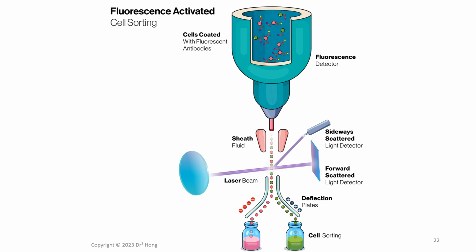Now, FACS is commonly used in research and clinical settings for a variety of applications, including cell sorting, cell cycle analysis, gene expression profiling, and protein analysis.